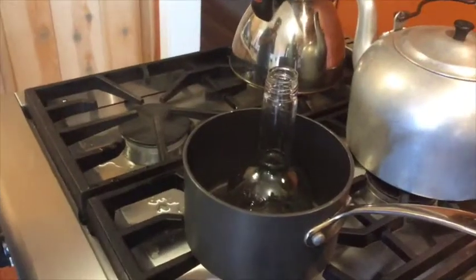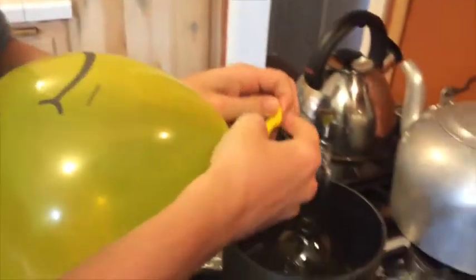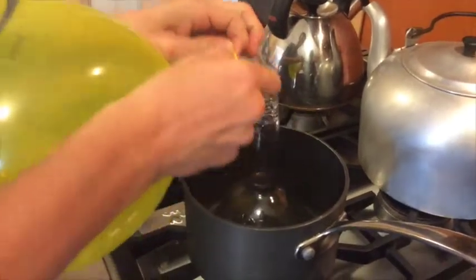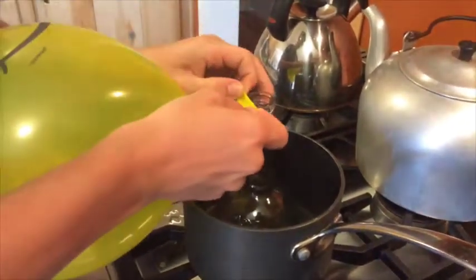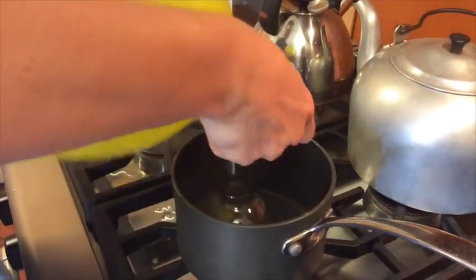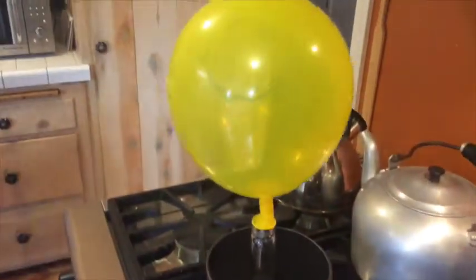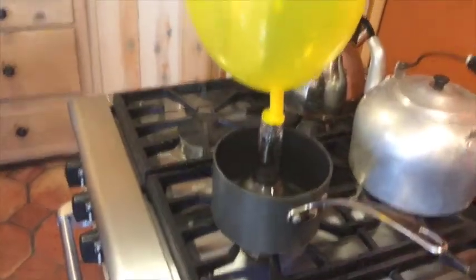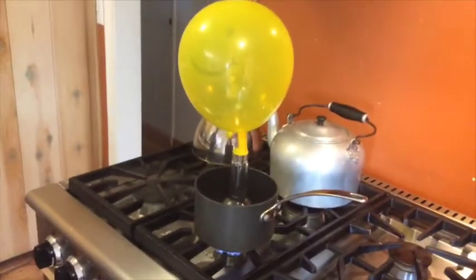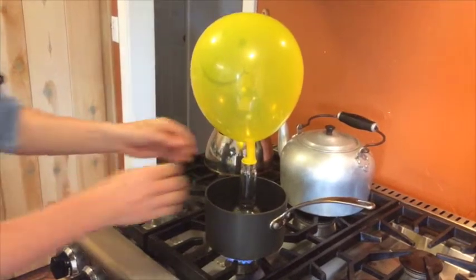Now Cole is going to blow up the balloon again, the third balloon. He's going to blow it up to be a little bigger than the other ones because he's going to have to put it over the glass flask so some air will escape. And there, the heat's on as well. Just keep filming so that they can see how big it gets. Is it getting any bigger?